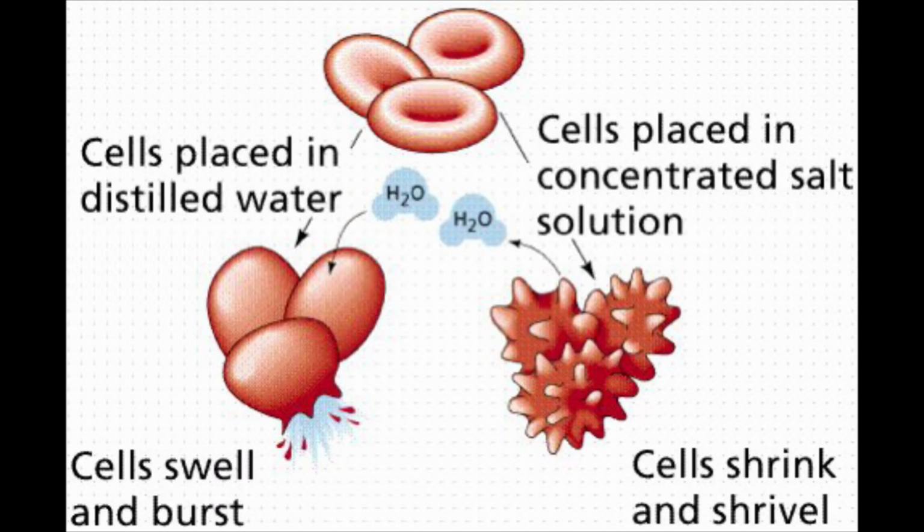In this lab, I'm actually going to be able to show you real cells absorbing or losing water depending on the situation that they're in. They'll actually be undergoing osmosis. Water will either leave the cell or go into the cell depending on the situation. And I'll be able to show you that in such a way where you can see it with your own eyes. There won't be any microscopes involved.